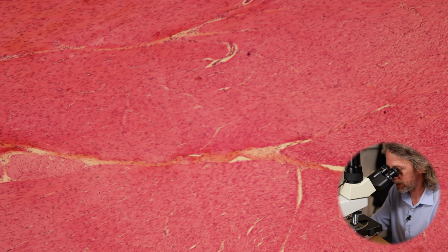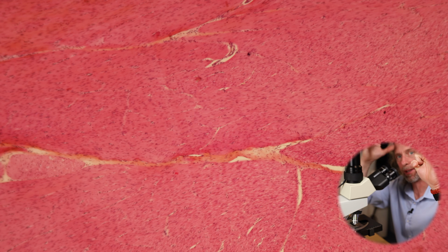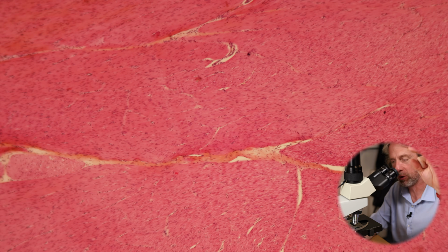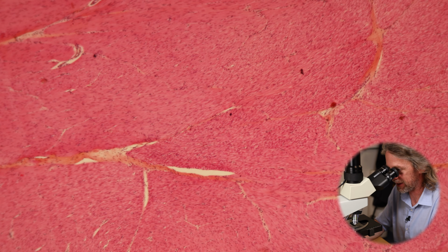So the pylorus of the stomach, that's the last bit of the stomach before we get to the small intestine, before we get to the duodenum. And in the pylorus, there's a thick muscular sphincter that keeps the food in the stomach while it's munching everything around and doing that mechanical digestion bit. So if we look at this, and this is quite a heavily stained section, we're only going to look at this briefly, not in too much detail. I think I've given you enough information already.